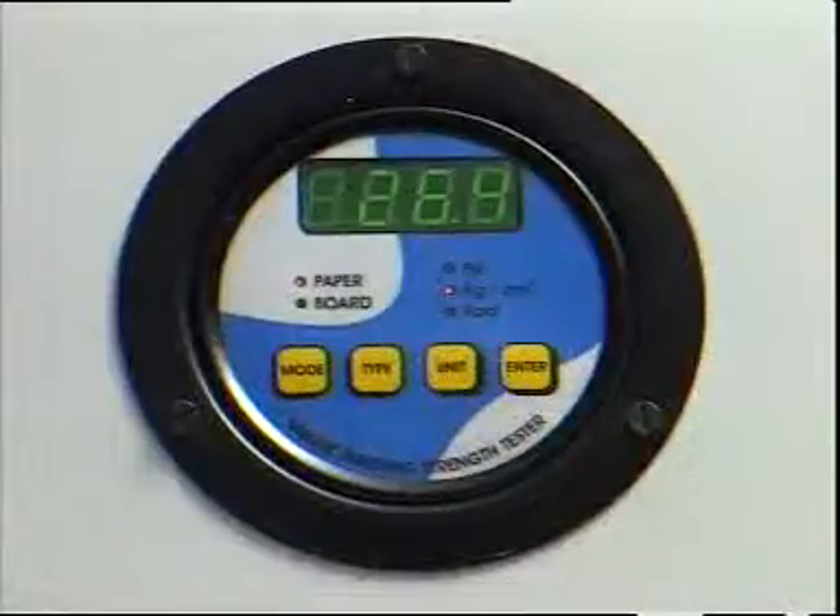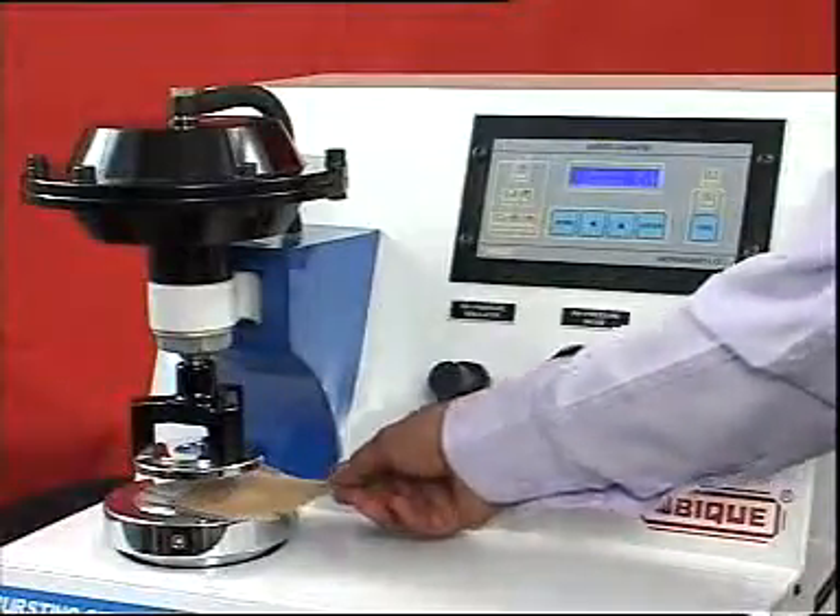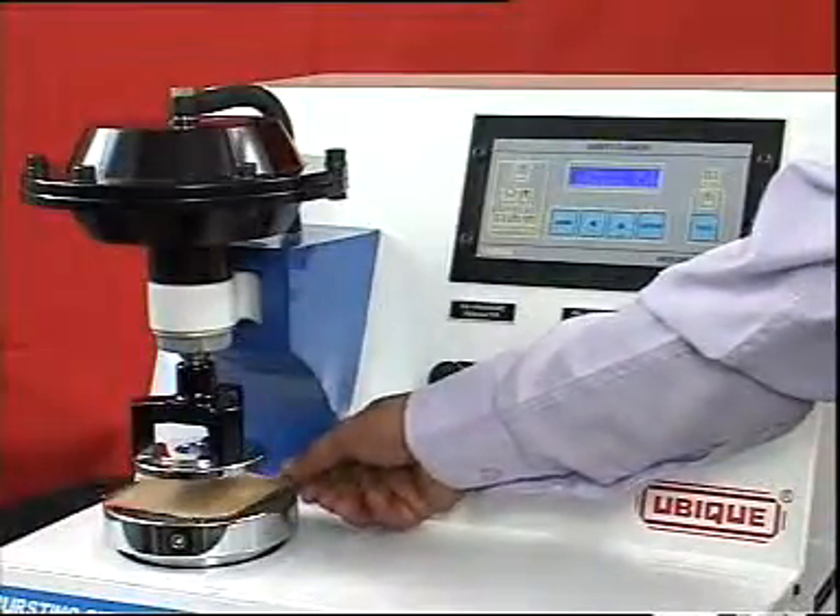Ubique bursting strength tester is easy to operate. It is scientifically calibrated for reliability and is regarded as a proven and reliable piece of equipment.